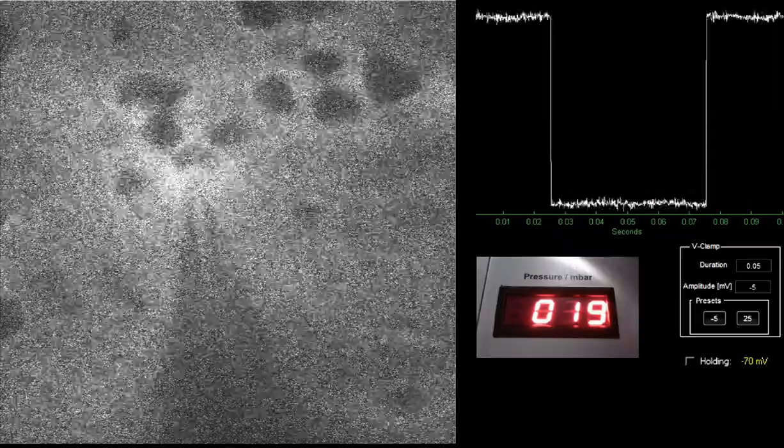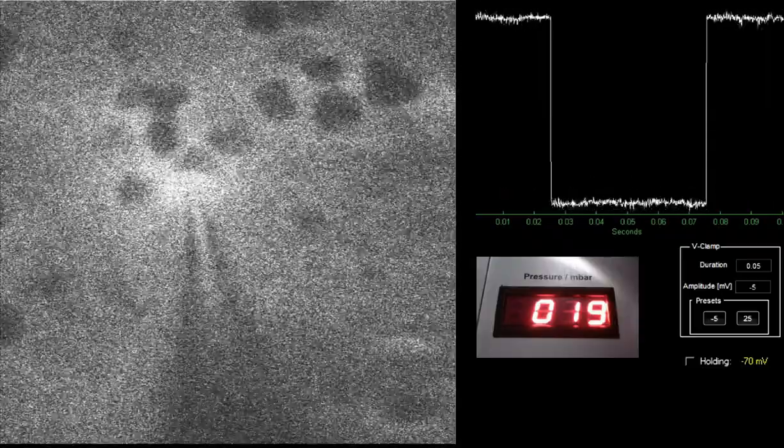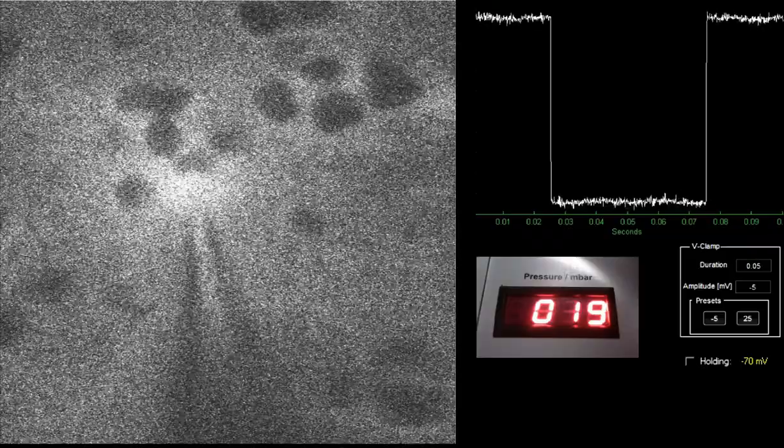Lower the pressure to approach a specific neuron. Ideally, a small dimple forms in the neuronal membrane. To this end, high optical resolution is essential.